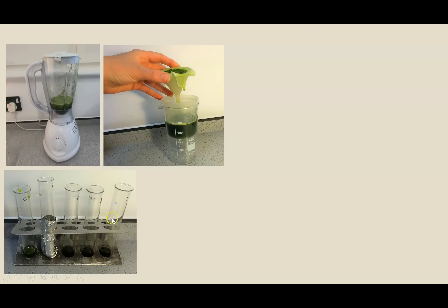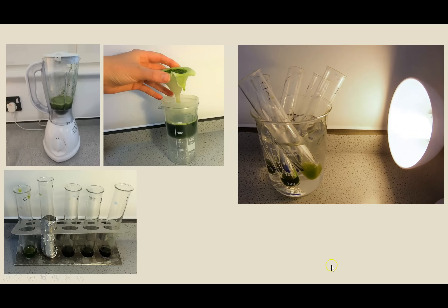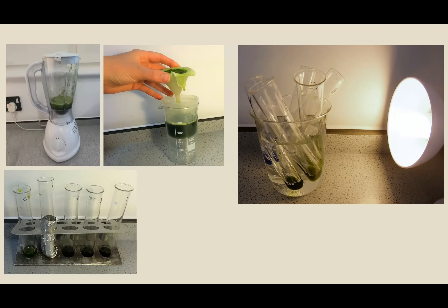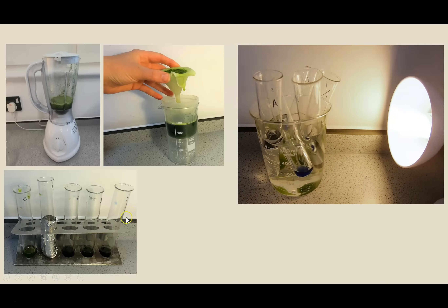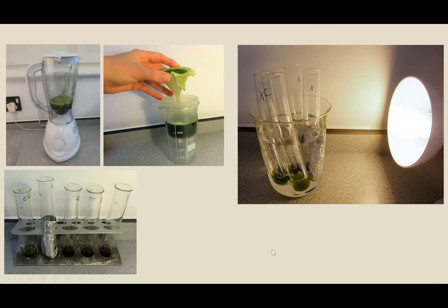With all my test tubes set up, I put them in an ice-cold water bath and have a light source, which is needed because it's the light-dependent reaction. At this point, the stop clock is started and I time how long it takes the two experimental tubes to turn exactly the same green color as test tube C. You'll notice I'm rotating the test tube positions because I only have one lamp source, meaning there isn't an equal distribution of light — which is a limitation. I stop the clock when test tube X matches the color of test tube C.